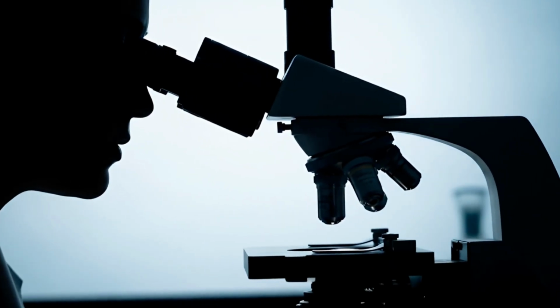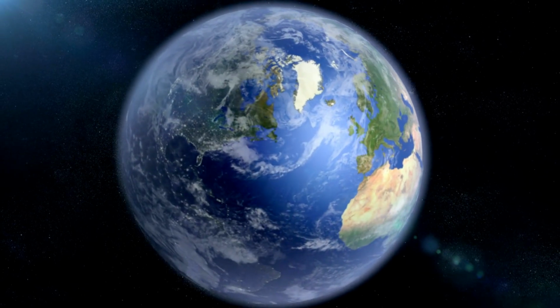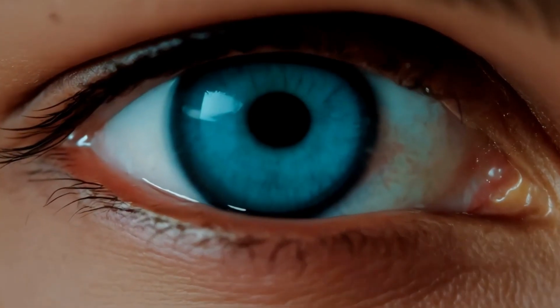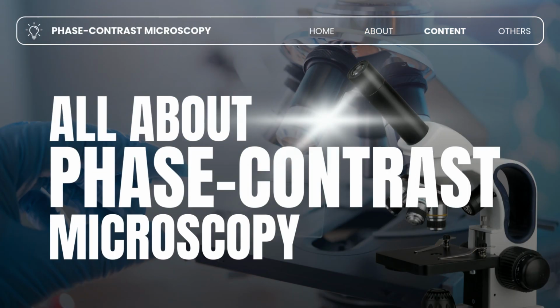It is a window that expands human sight beyond its limits, reminding us that the world is always more than meets the eye. With that, come join us to unravel the world of phase contrast microscopy. So what is phase contrast microscopy?